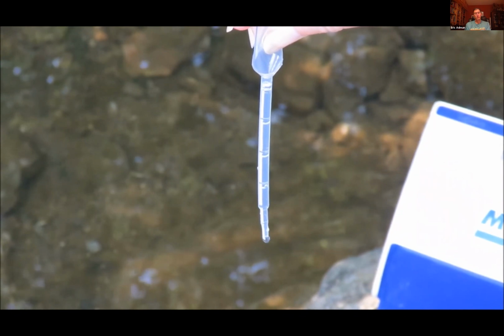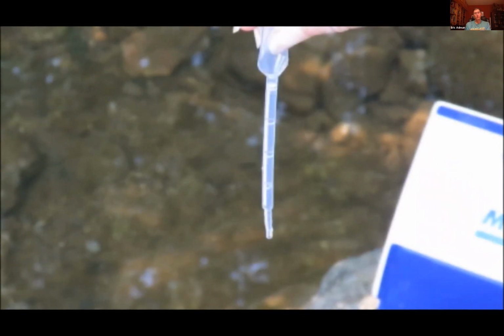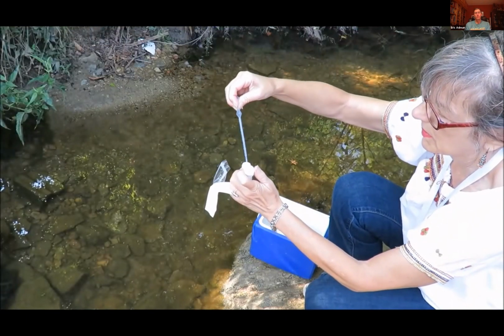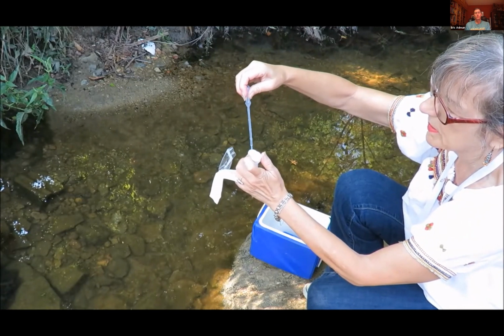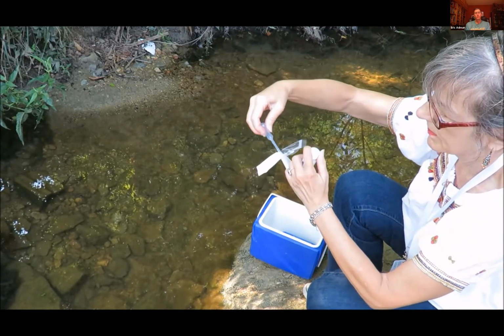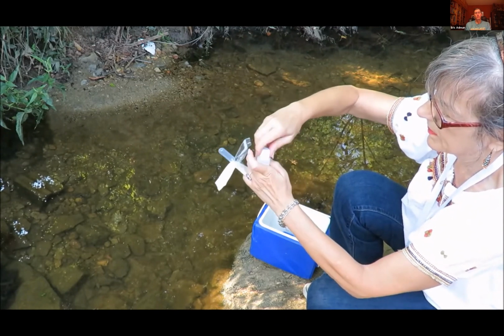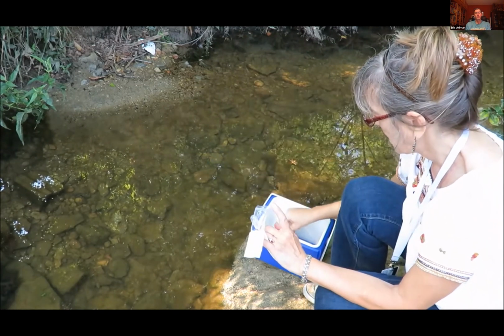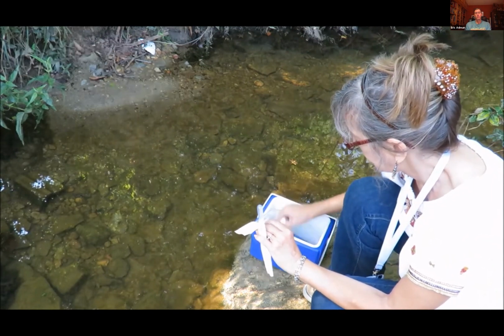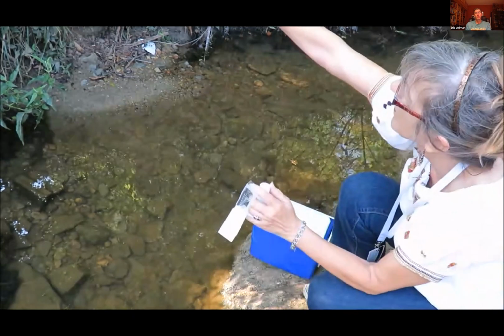Carefully squeeze the bulb and expel excess water to the desired sample volume. 1 milliliter sample volume is recommended and is usually sufficient. Be sure to use the same volume for each of the 3 replicates and record volumes on data forms. Remove the cap from the media bottle and hold it without touching the inside. Squirt the sample water into the bottle of liquid media without placing your hand or face over the open bottle. Cap the bottle securely and place inside the cooler. Repeat these steps until all 3 media bottles are inoculated with water from the same spot.